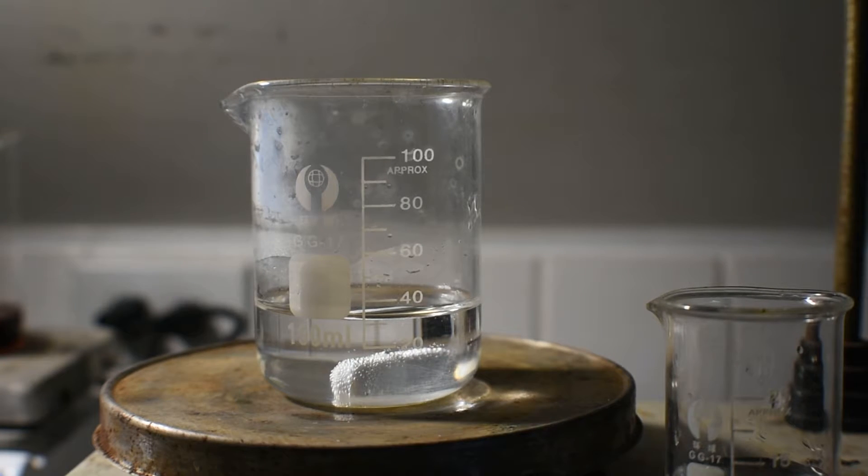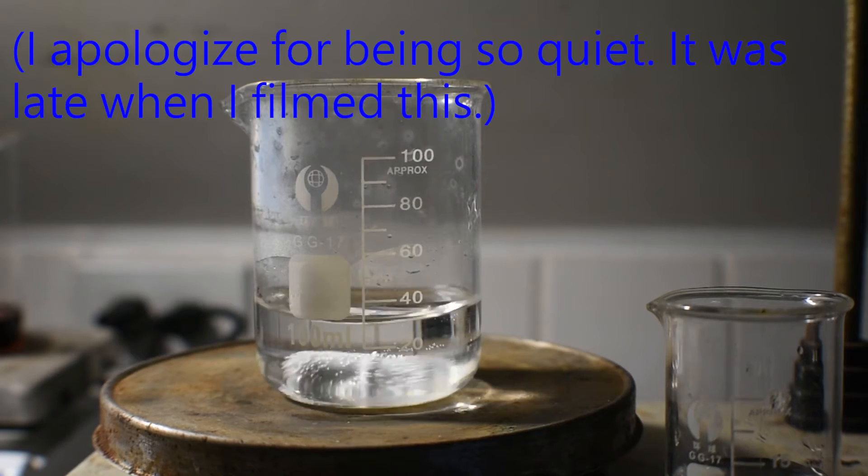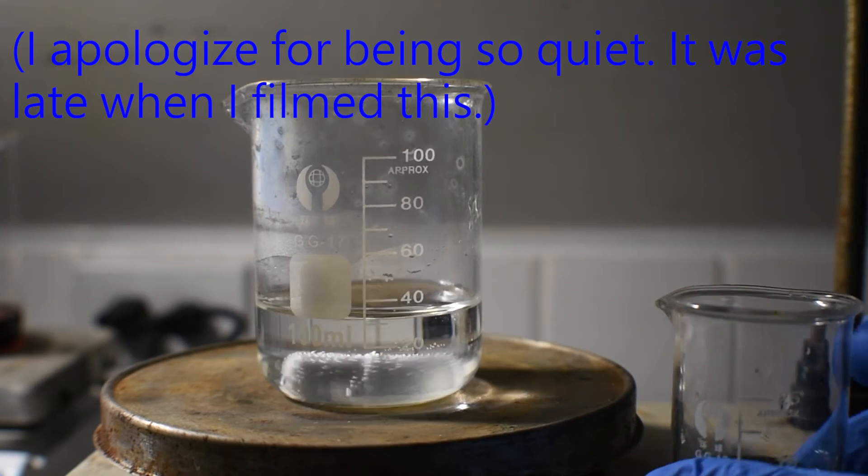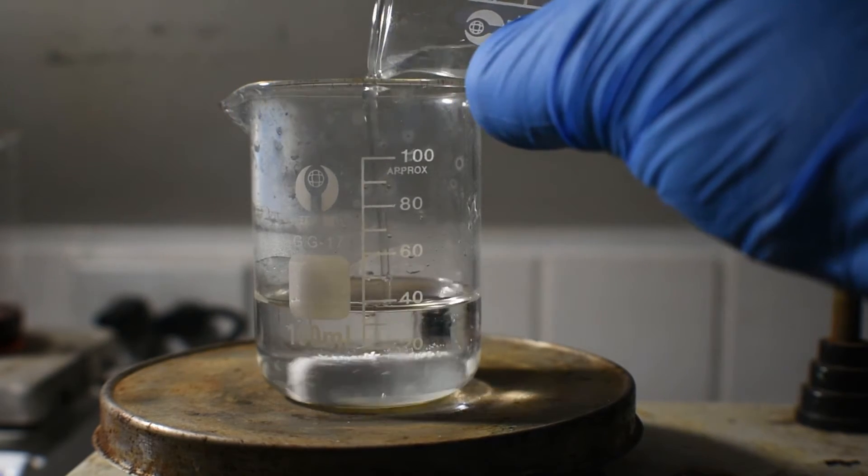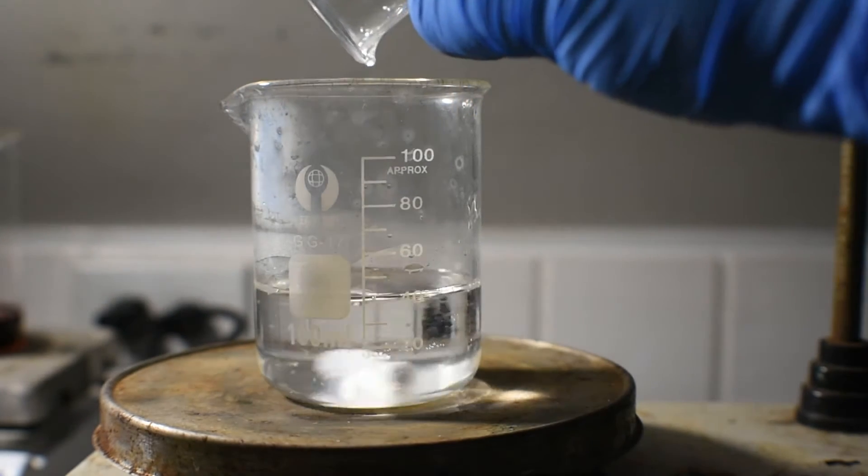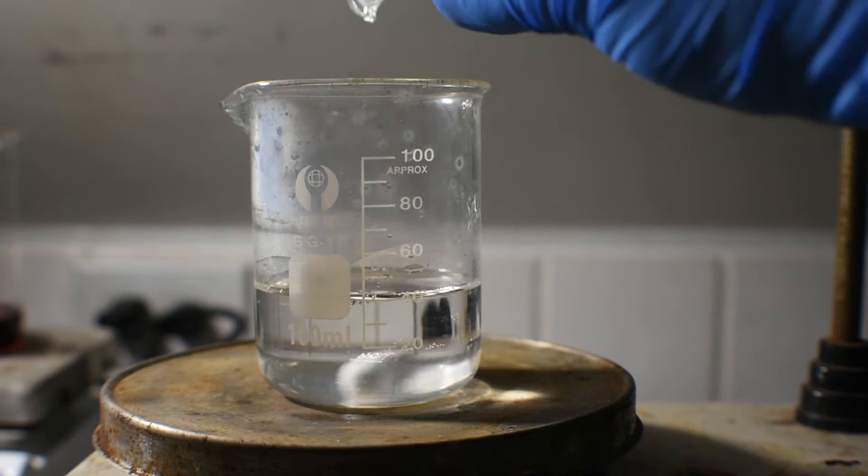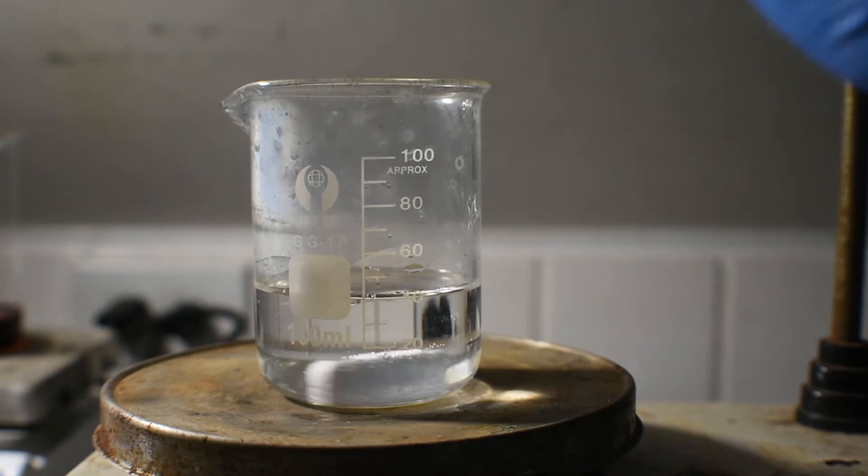Now I'm going to put this in an ice bath to cool down. Once the ethylenediamine solution is nice and cool, with stirring, I'm now going to add the 6 molar hydrochloric acid. This will only partially neutralize the ethylenediamine, which is what we want.